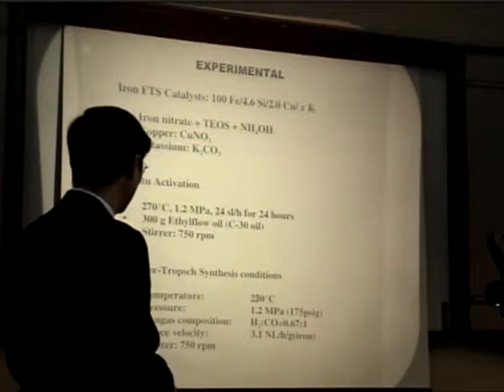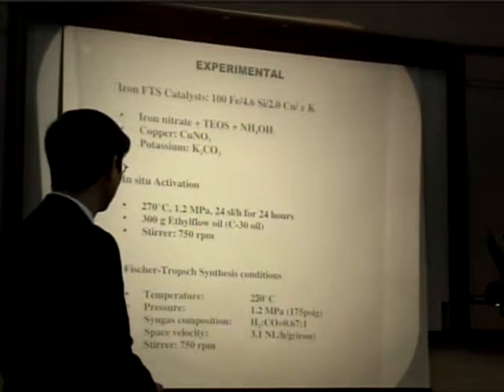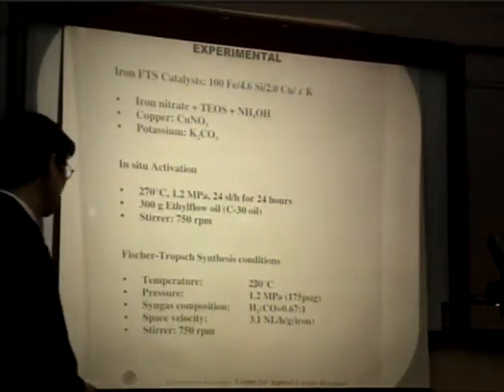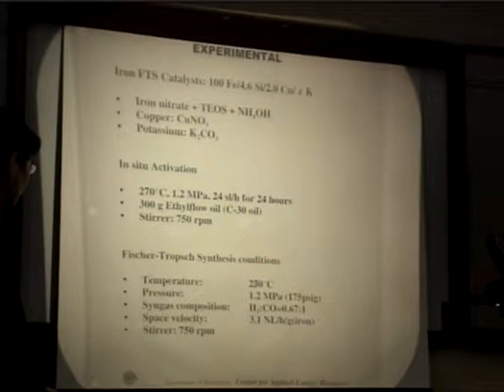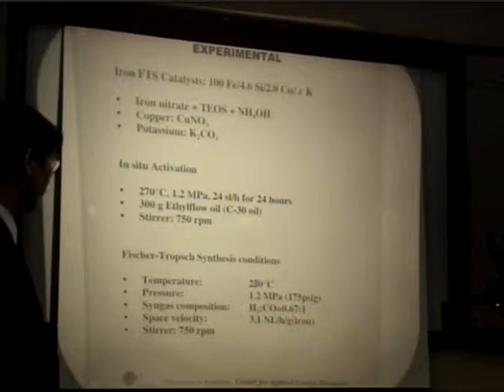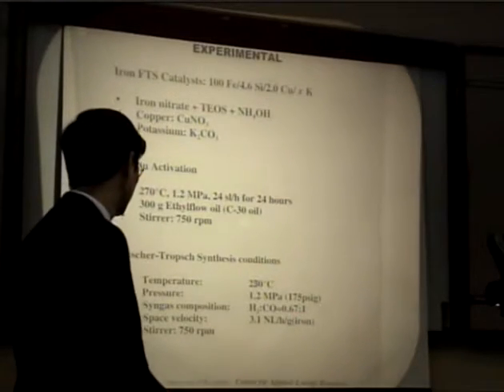We use the oil as a study medium. The actual Fischer-Tropsch synthesis conditions are as follows: 230 degrees C and 12 atmosphere, with a gas composition of hydrogen to CO of 0.67.